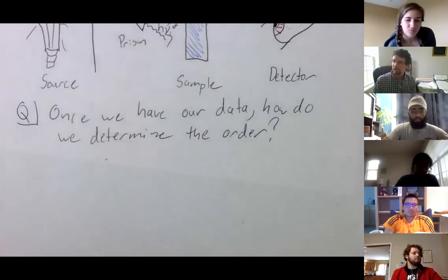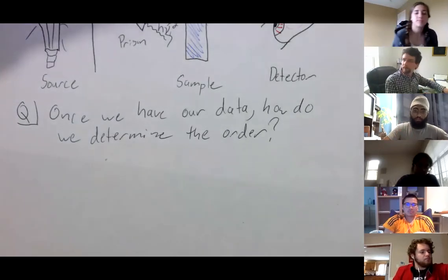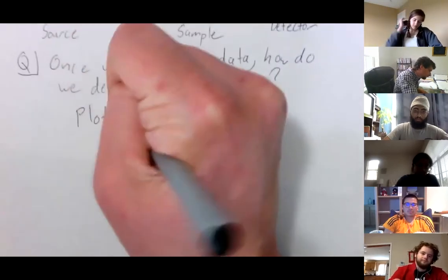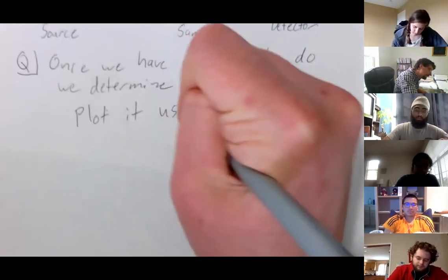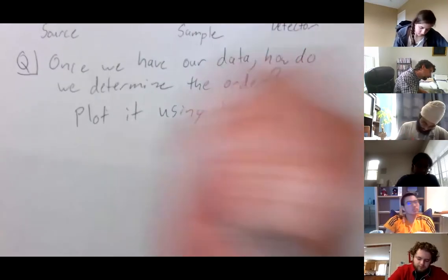Plot it. So, plot it, did you say? Yeah, so we're going to plot it. There are a couple different ways. So we plot it using integrated rate laws.